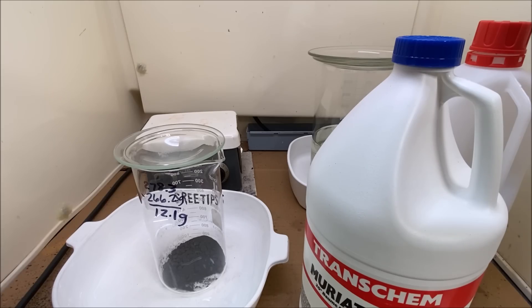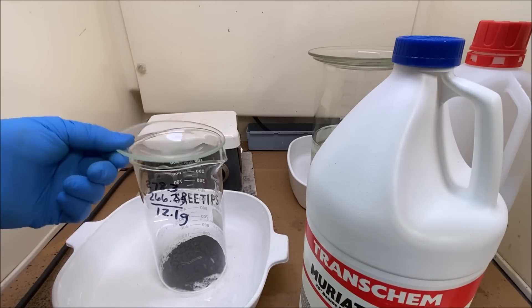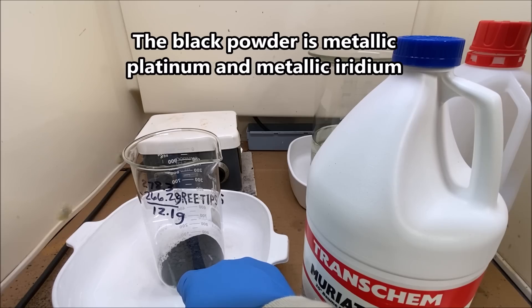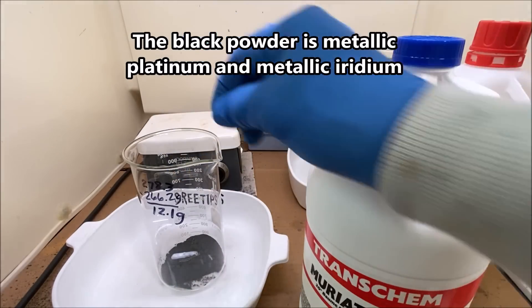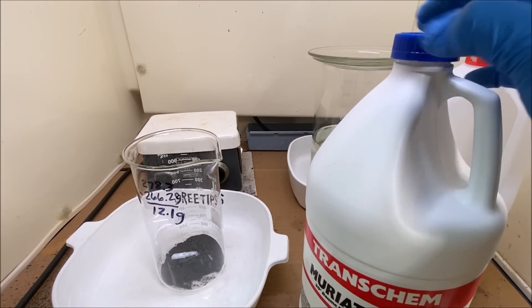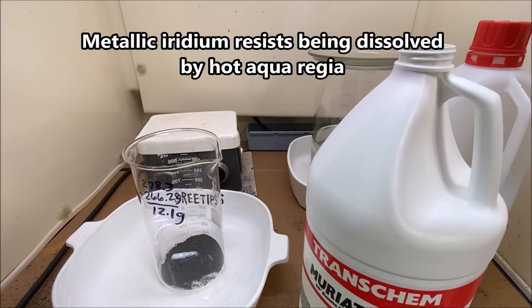Welcome back to part five in the series here with the platinum refining. I've got our metal rendered back into metal with zinc. The advantage of zinc is that it works quickly. The disadvantage is that if there's other metals in there, they too will precipitate out.